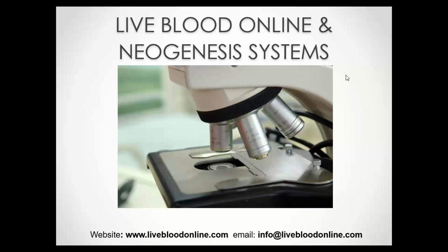in conventional hematology. There are, however, other anomalies in live and dry blood that were identified clinically by researchers working with live blood analysis and dry blood analysis over the course of many years. Many of these relate to conditions that can't be tested for with conventional investigations, so they are quite difficult to verify in a way that would be acceptable to conventional medicine. But we always see the anomalies respond to the recommended interventions.